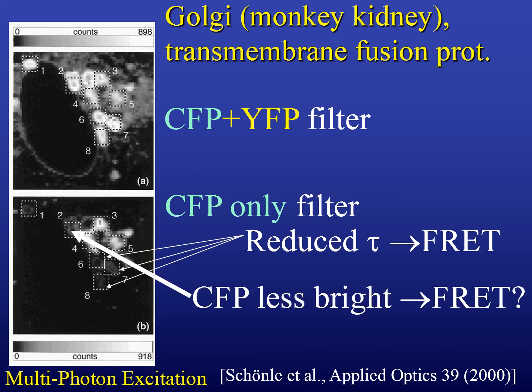So this is an indication that there might be Förster transfer going on, but it's not a clear proof yet just by the brightness, because there could be tons of different other effects changing the molecular species, for example, salt concentrations, similar things that can massively change the fluorescence lifetime of species.